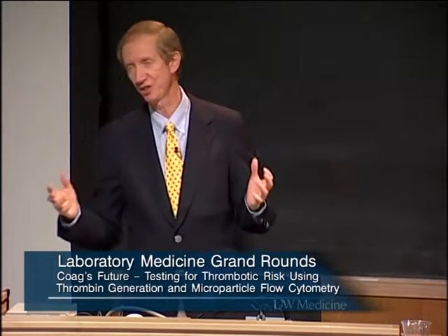So I was a little bit surprised that you were courageous enough to say that you understood the distribution of the microparticles and that you were measuring about half of them. If you use atomic force microscopy as the gold standard, is that what you're basing that half on? Yes. Okay. So the question is, why are you standing up here saying you think you're measuring half of them, when that could be completely wrong? And I totally agree, I could be completely wrong.